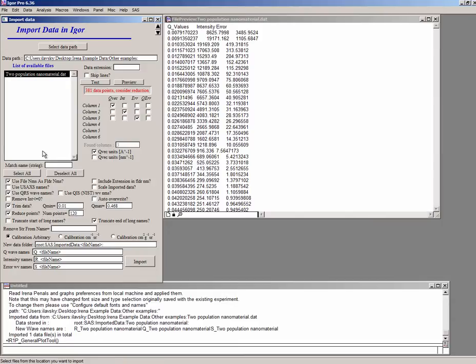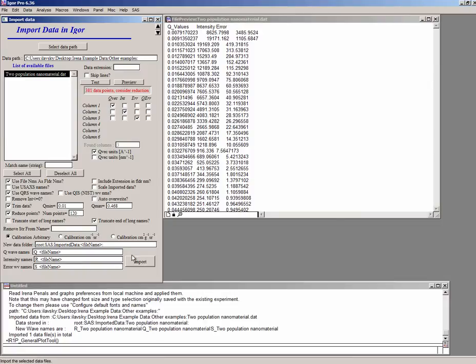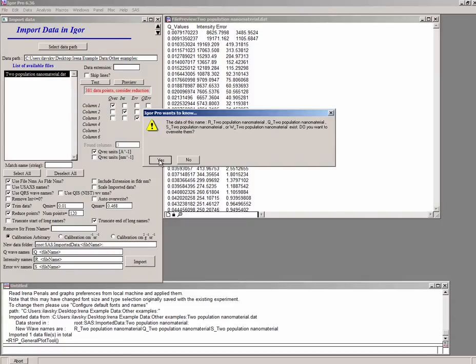Now you have to reduce the number of points to one third or less what it found here. So you cannot do 200 points because it just doesn't know what to do with that. It has to reduce enough. So in this case, 120 points is probably reasonable. You're going to see that in a second. So then you could do a few other things in here. I suggest that you read the manual about what are the various options in here. So let's now re-import the data. And notice Igor now knows that the data already exists and basically is asking, do you want to override the old ones? And we can say yes.